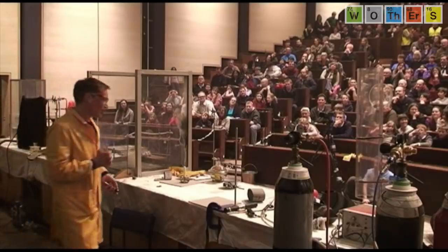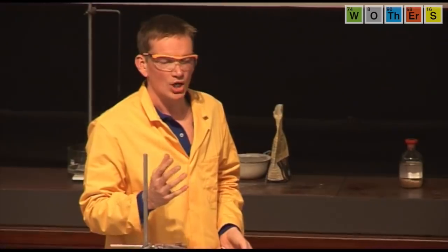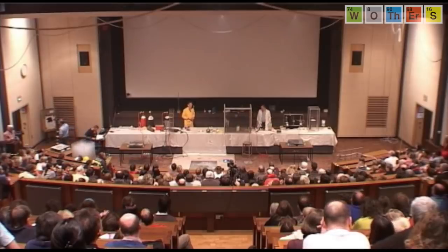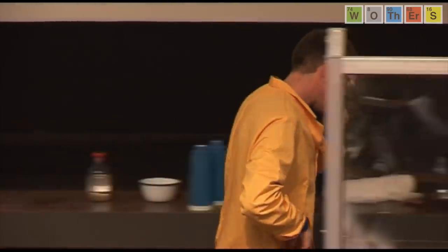But I just wanted to show that everything that we've seen reacting so far has all had oxygen in it. So all the burning reactions we've had have had oxygen. Do things have to have oxygen in order to burn? Can we burn things without using any oxygen?